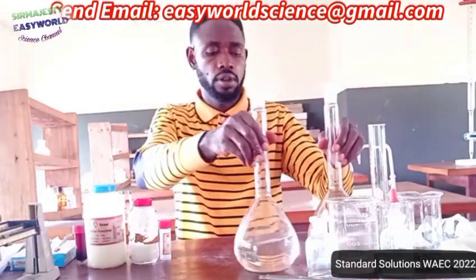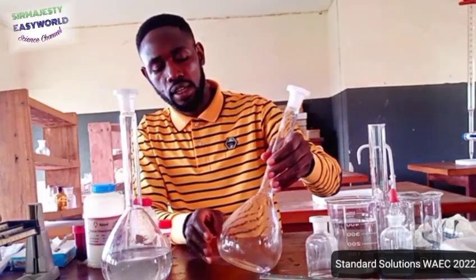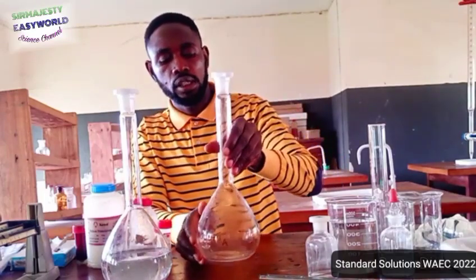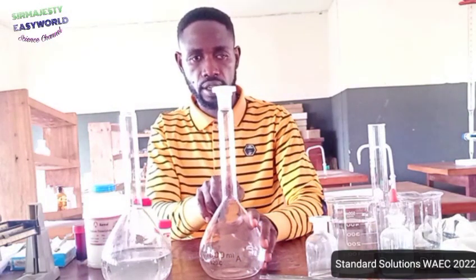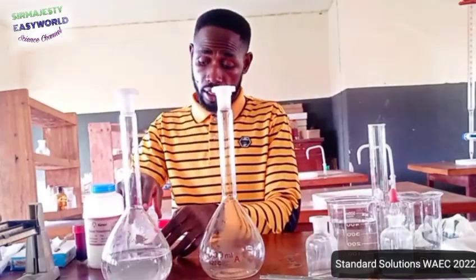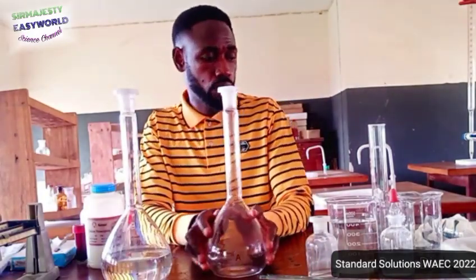First, what are the materials we need? We need 2 volumetric flasks. The 2 volumetric flasks are here, the 1000 ml. That is for accurate volume measurement. You see the mark, this ring here is for 1000, then here also for 1000. Then I filled one with water. I'm supposed to fill this one also.